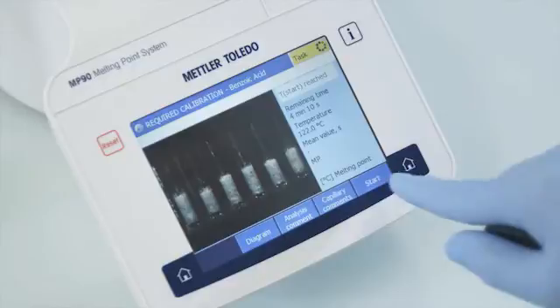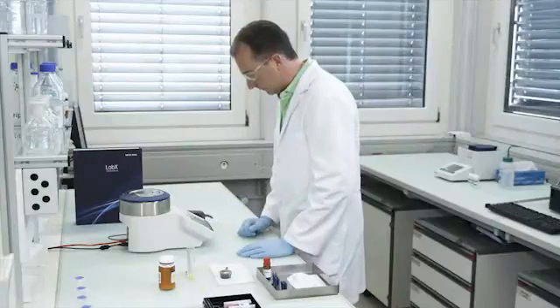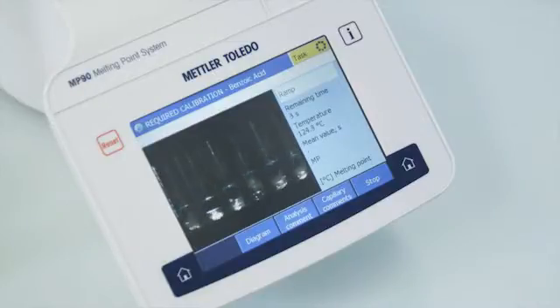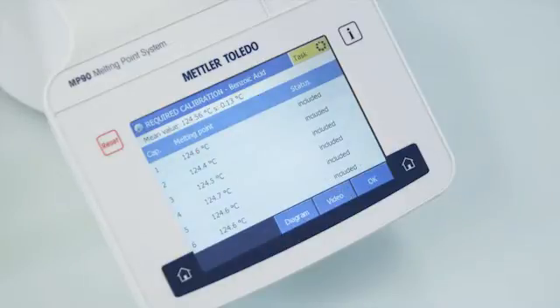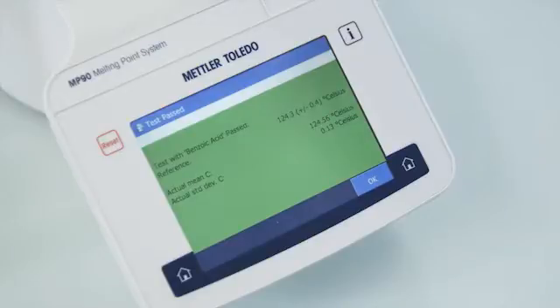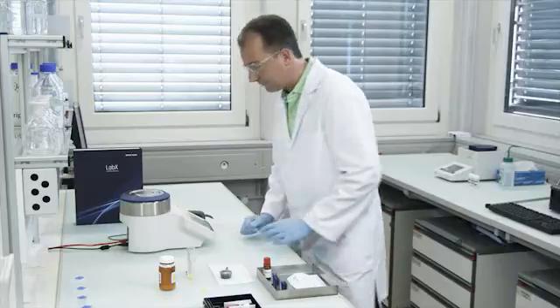Paul starts the calibration. The results appear in green. Paul can trust that this means they are within the tolerances defined in the SOP.